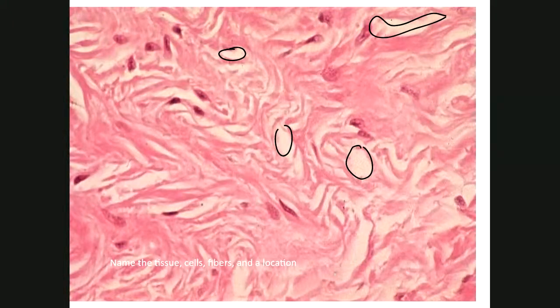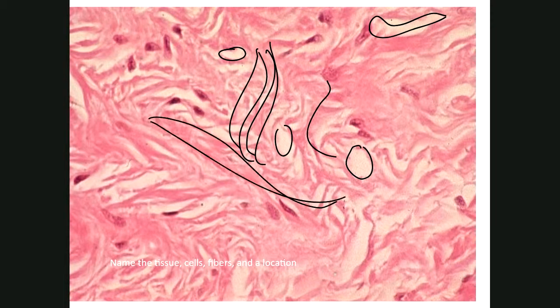What you do see are fibers. These fibers going in different directions. The fibers are collagen fibers. Typically, collagen fibers color pinkish on the stains used. And that tells you fibers going in different directions and looks like only one type of fiber. That leaves you with either loose connective tissue or dense connective tissue. Loose connective tissue, well, that will be areolar. Areolar has three different types of fibers. You only see here really one type of fiber, so forget areolar.